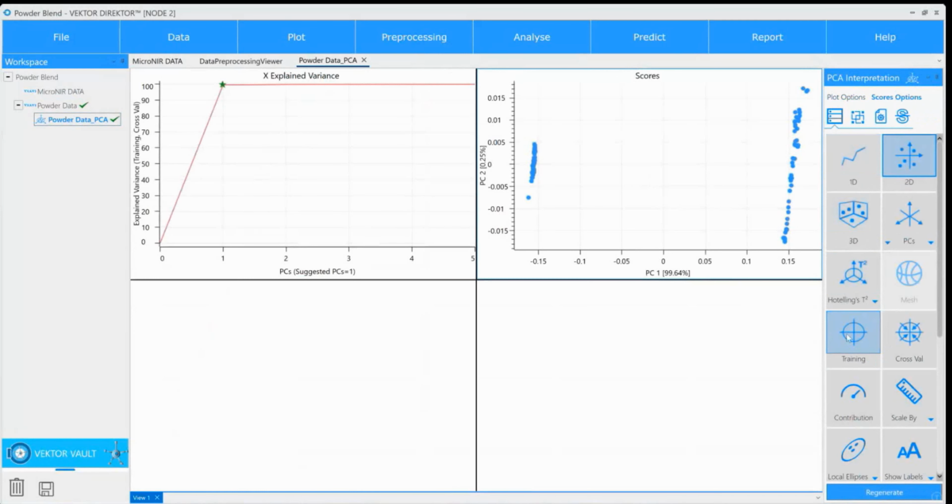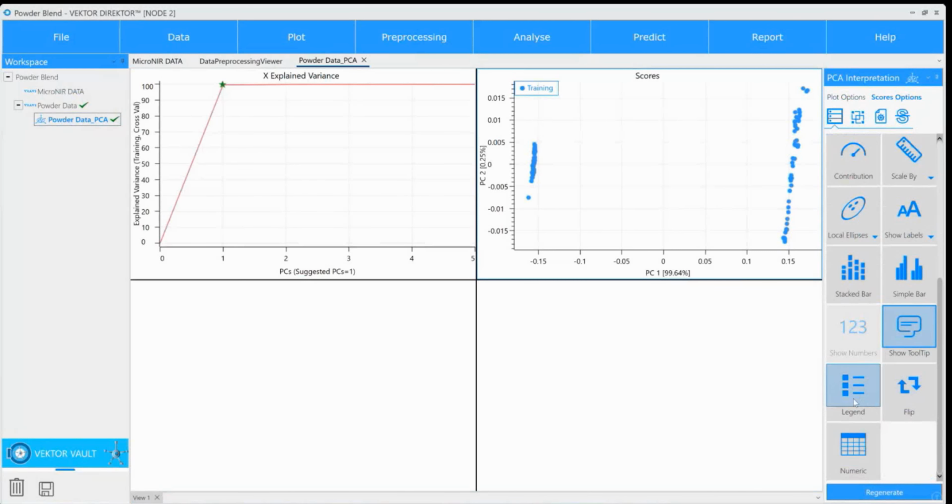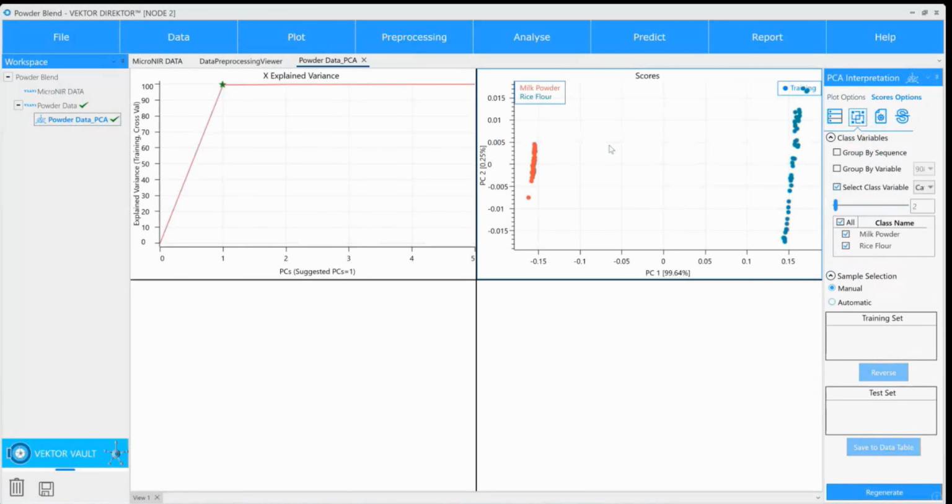So hopefully, turn the class variables on. Okay. Hopefully, all things being equal, it'll start somewhere here because there's going to be a bit of rice flour in, and then I'll dump a bunch of rice flour in. Hopefully, it moves a little bit into this direction. Won't fully go here, obviously, but might be like moving from here to like here, something like that.